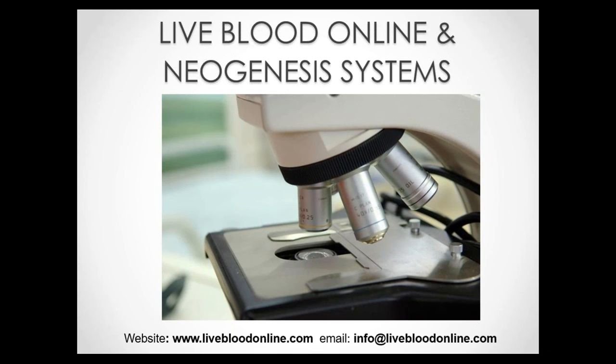But with live blood analysis, because we are scanning the sample for any visible anomalies, instead of choosing what specific tests to do on a form, there's actually very little risk of not finding the most relevant anomalies. I've seen it work so many times and so consistently in practice, and I've seen it help people who have tried nearly every other test, that I feel that if I don't do a live blood test on every client that comes to see me, I'm likely to miss the boat with him completely.